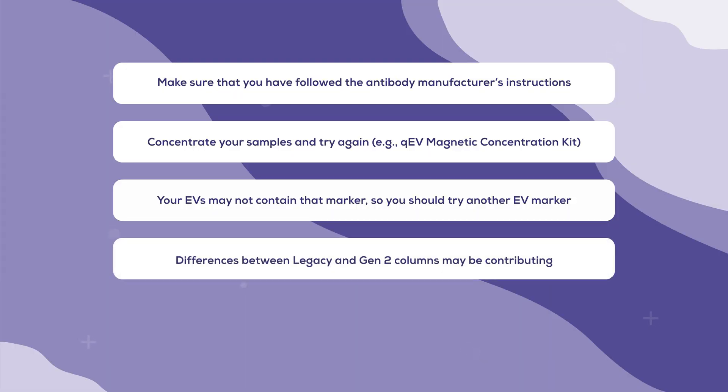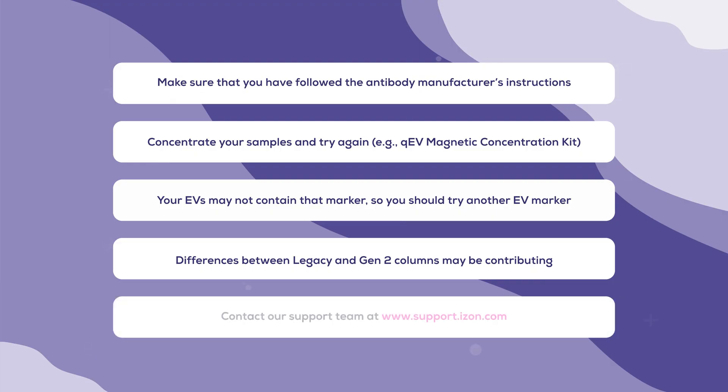Finally comes interpretation of your results. If they don't match your expectations, then it's always best to double check. In this case, it's best to run the blot again with new samples before you make any scientific interpretations, avoiding any potential misinterpretation. If your results are different with gen 2 columns as compared to legacy columns, then it is possible that the protein now missing was actually a contaminant, as gen 2 columns result in purer isolates than legacy columns were ever capable of producing. If, after following this guide, you're still having trouble with your EV Western blot, then you can get in touch with our support team, who will be happy to help you.